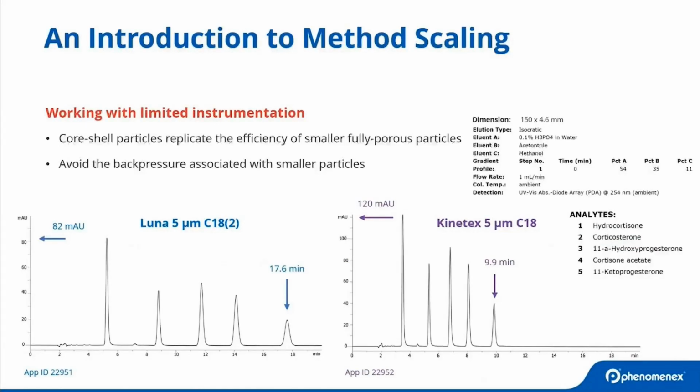Once again, though, we need to be mindful of instrument considerations, specifically when working within back pressure limitations. And here is where core shell particles allow one to pursue UHPLC levels of efficiency and resolution, as well as runtime, while avoiding the back pressures that are typically associated with smaller particles.